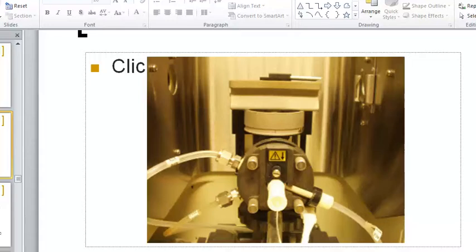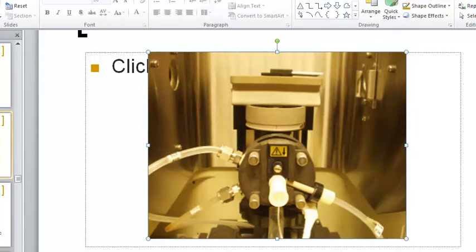All right, well, down below this round circular piece, that is my nebulizer. I've got one intake for acetylene, maybe one intake for nitrous if this machine's capable of using it, and one intake for air. And then here, this piece of plastic tubing that goes up through the front, that is my capillary tube or my nebulizer tube.